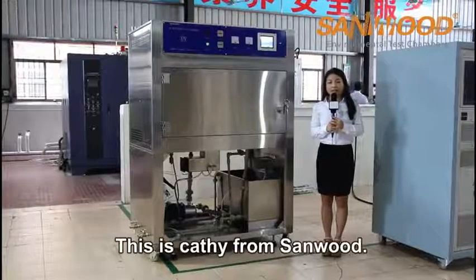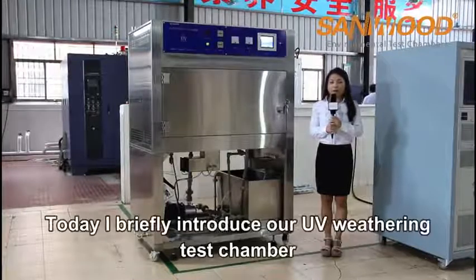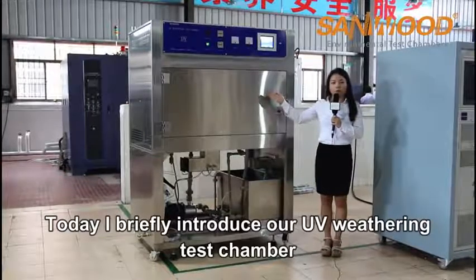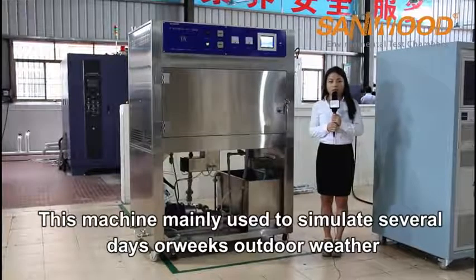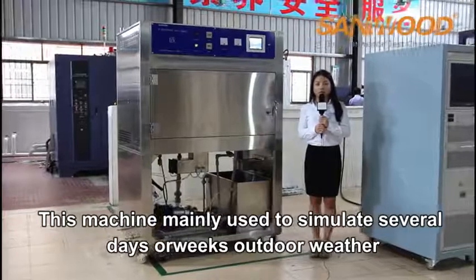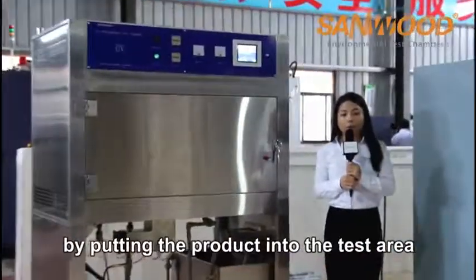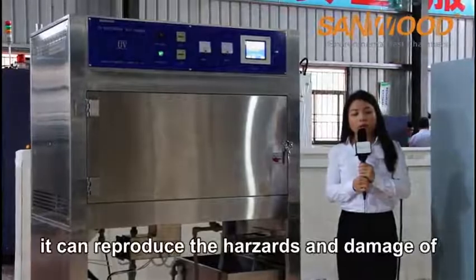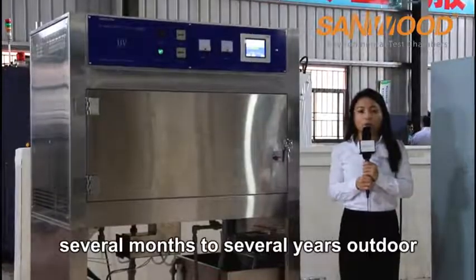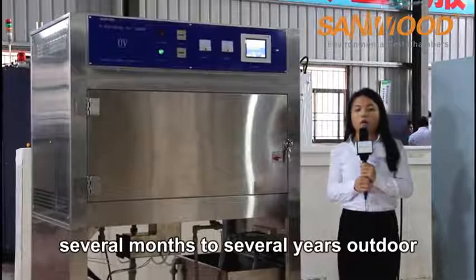Hi friends, this is Cassie from Sunwood. Today I briefly introduce our UV weathering test chamber. This machine is mainly used to simulate several days or weeks of outdoor weather by putting the product into the test area. It can reproduce the hazards and damage of several months to several years outdoors.